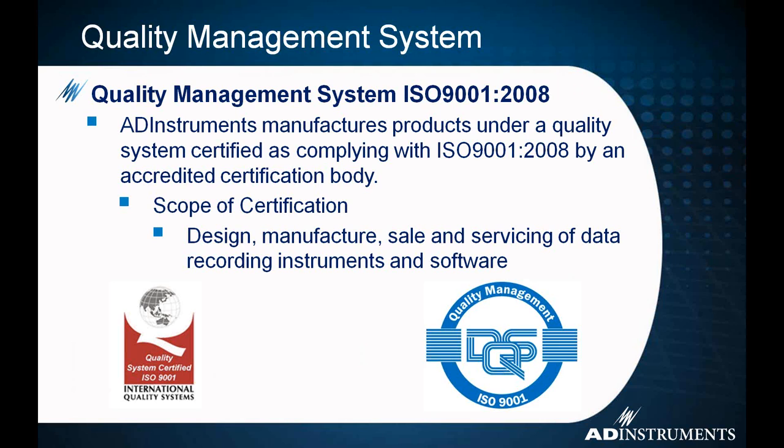We also get a question quite often: how do I know what's coming out of the PowerLab is what really is being input into it? How do I know what I see in LabChart is true? We spent considerable time and money to get ISO 9001 certified as a quality management system.